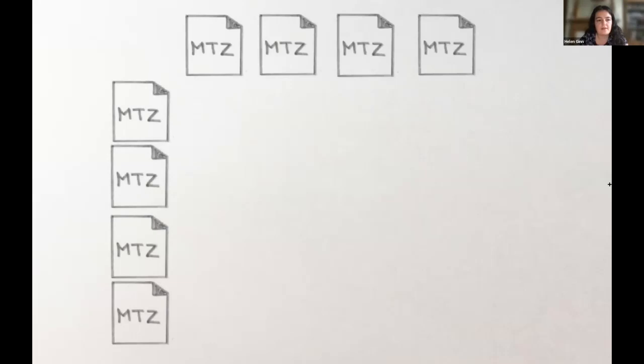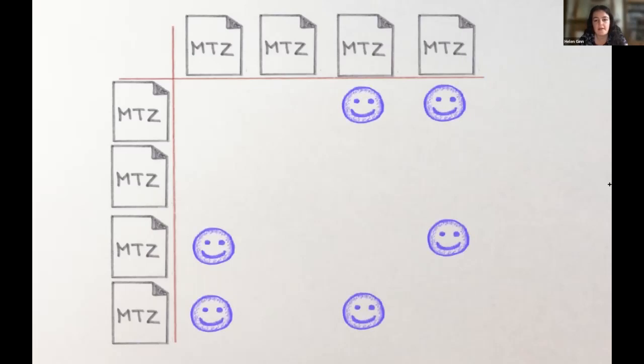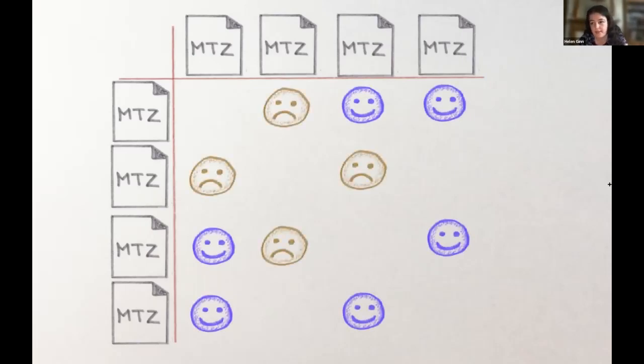So once you have such a set of correlation coefficients, you can then insert them into a matrix of looking at the pairs of reflection lists and deciding which ones behave in similar ways with happy faces and which ones behave in different ways with sad faces, and some which may behave similarly but not quite as much. And once you have such a matrix, you can then explore it in Cluster4X.